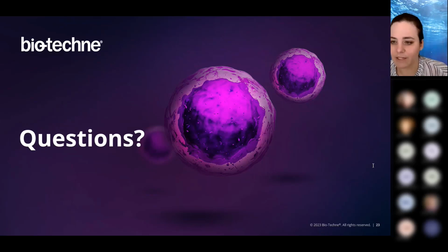You show total protein and protein normalization at 0.2 mg per mil concentration. Where do you draw the line, i.e. if your lysate concentration is 0.2 mg per mil, what method would you recommend and why? So at that point, I would probably recommend the total protein assay. It's got a little bit of a wider dynamic range. I believe we have used it up to 0.4 in practice, but we do like to keep it under 0.2 ideally, mg per mil.